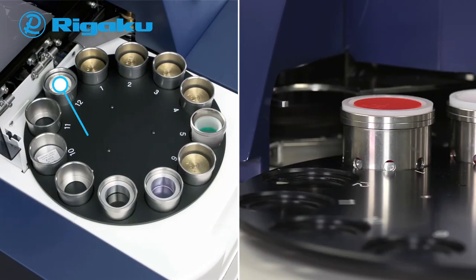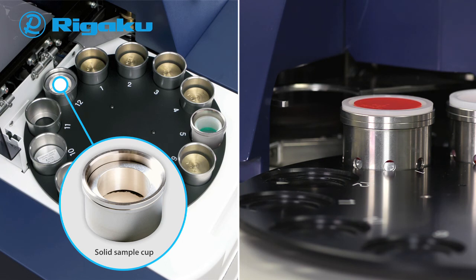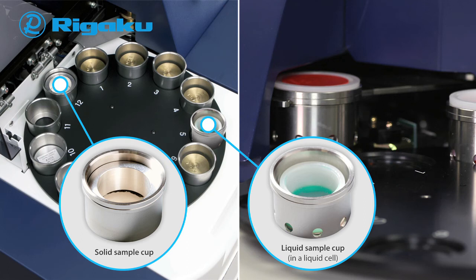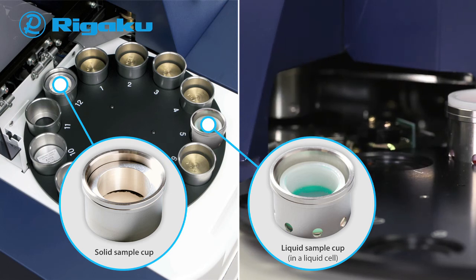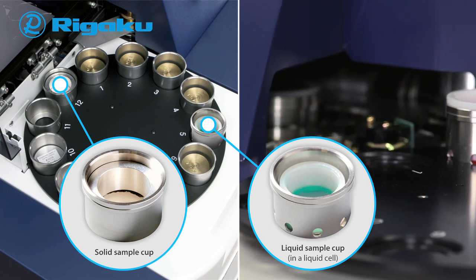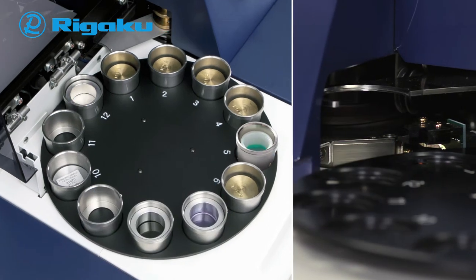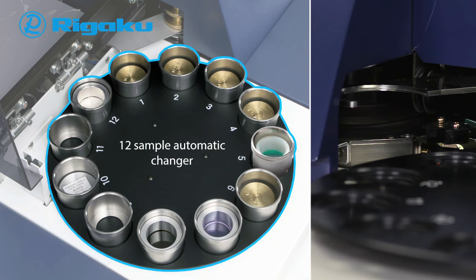Solid samples such as metal alloy and pressed powder briquettes are measured under vacuum. Optionally, liquid samples such as aqueous solutions or oil are poured into liquid cells, covered with analysis film, and measured under helium. A 12-position automatic sample changer is standard, enabling operators to carry out routine analysis smoothly. For added operator flexibility, during a measurement you can replace samples on the changer without interrupting the ongoing measurement.